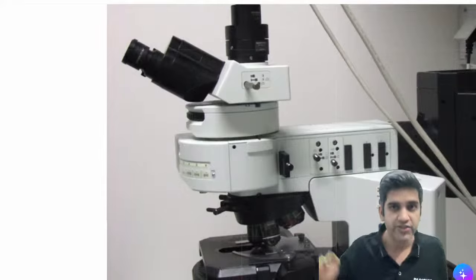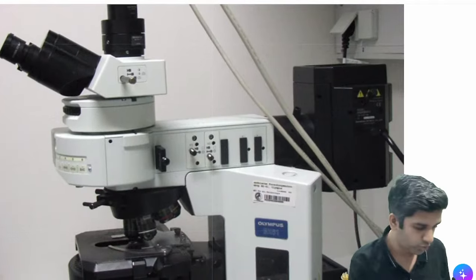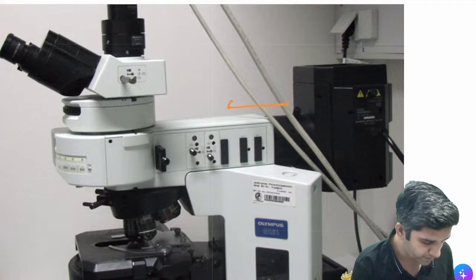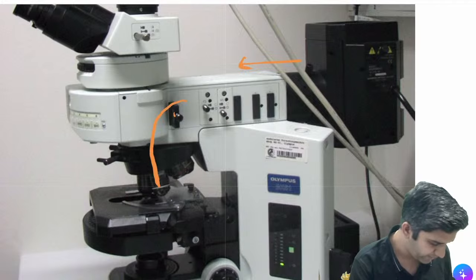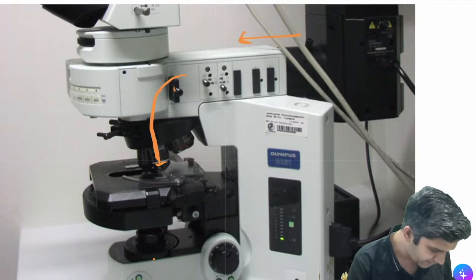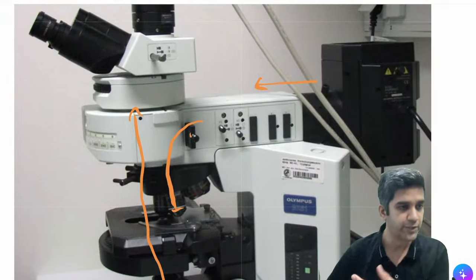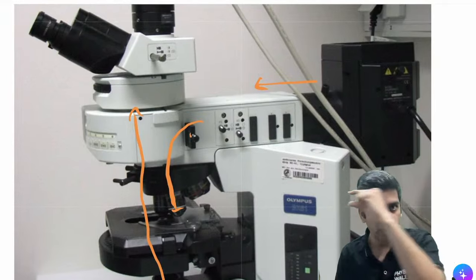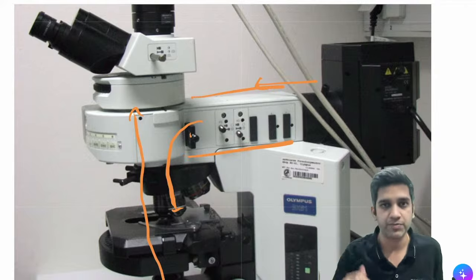The biggest difference is the light source comes from here. So what happens in a fluorescent microscope is the light comes from here, and then it goes inside, hits here, and then it also reflects from here and goes to the eyepiece. So there's a dual direction. If you see, a light source is coming on the top and there's a chamber via which the light travels. Actually, there are filters.